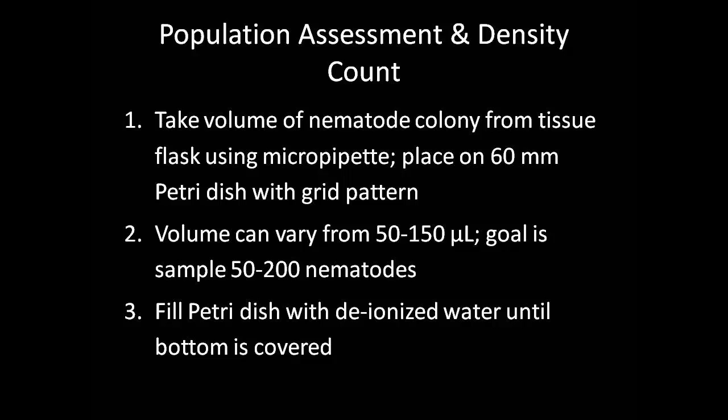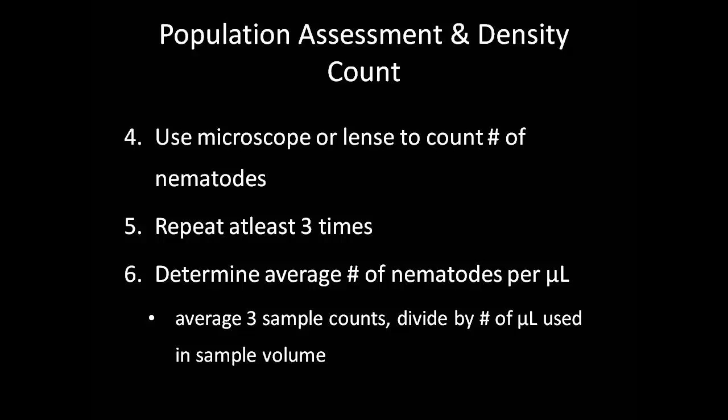The population density assessment of the existing nematode population is conducted by taking a specific volume of your nematode colony from the tissue flask using the micropipette and placing it on a small 60-millimeter petri dish that has had a grid scratched onto the bottom of it. The specific sample volume taken can vary from 50 to 150 microliters; the goal is to achieve a sample containing approximately 50 to 200 nematodes, taking a larger sample with a less concentrated colony and a smaller sample with a more concentrated colony. The petri dish is then filled with deionized water until it covers the bottom fully. Using the microscope or magnifying lens, count the number of nematodes in the petri dish. It helps to use a clicker counter. You should repeat this step three times to achieve a reliable population count. To obtain the average number of nematodes per microliter, average the three population counts and then divide by the number of microliters used in the sample volume.